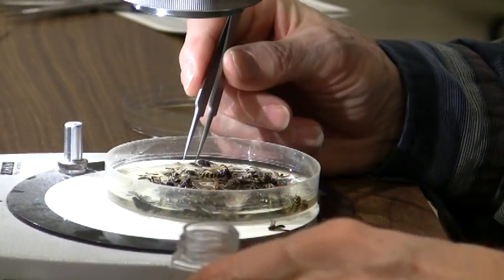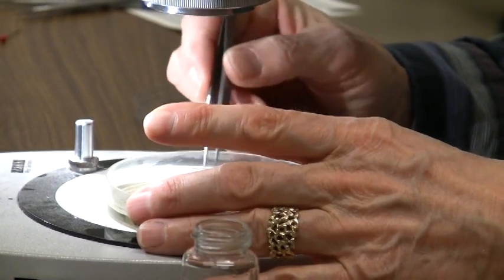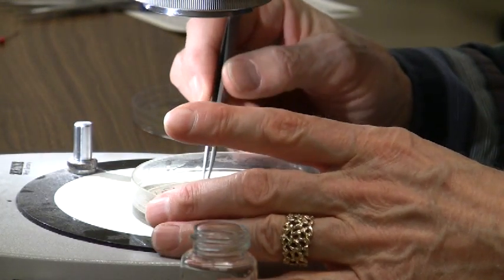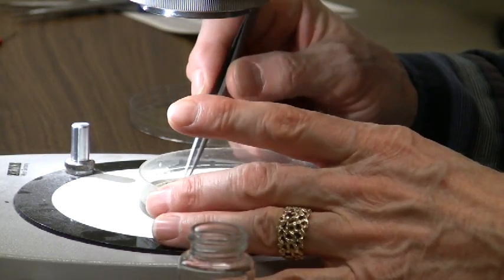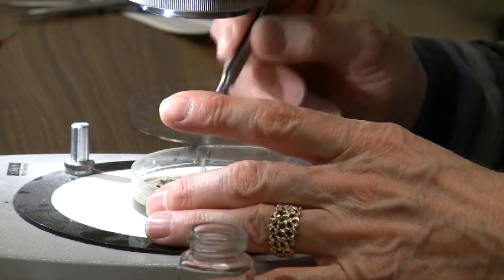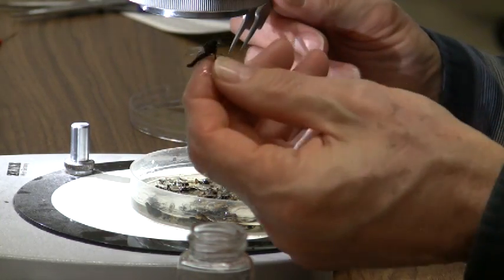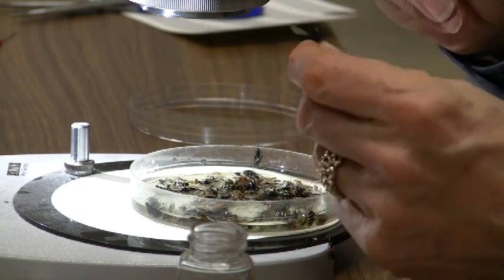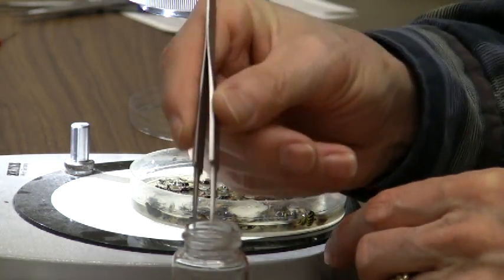Remember, these collections don't require a lot of insects. Forty is the actual maximum number of specimens you can submit. What you want to do is spend some time looking around for things that look different. Now that looks different — I don't think I've seen that before. It's probably a fly. I don't have a dipteran in my collection yet, so I'll drop that in there.